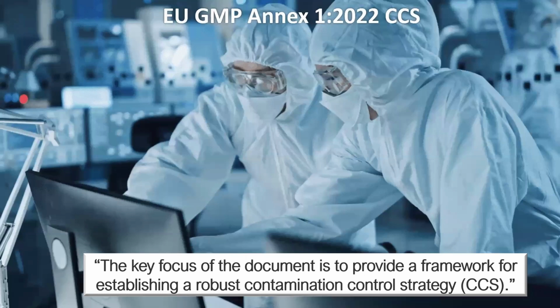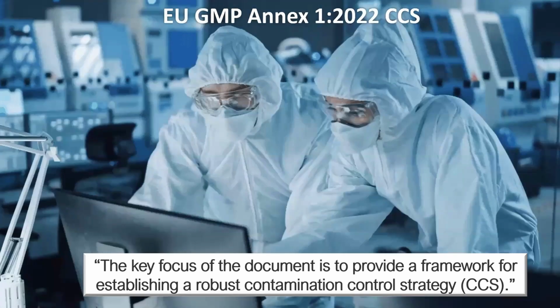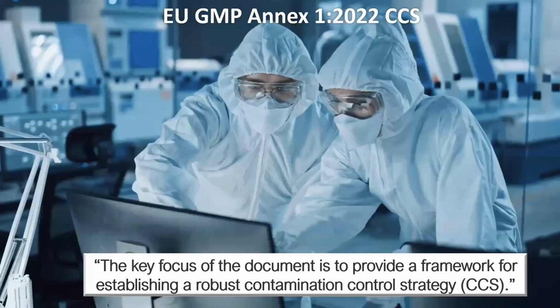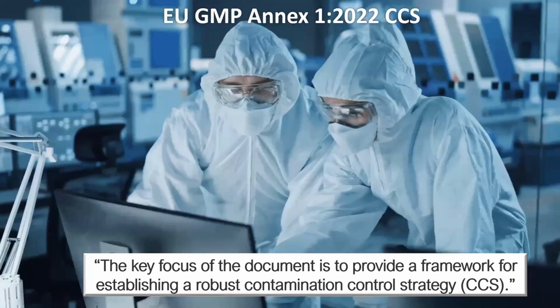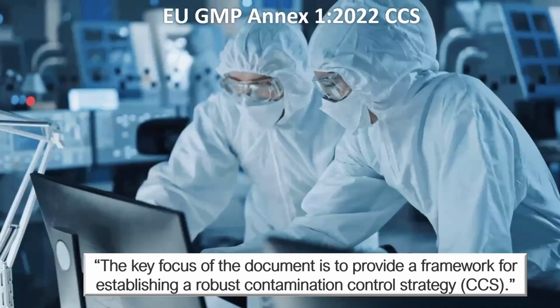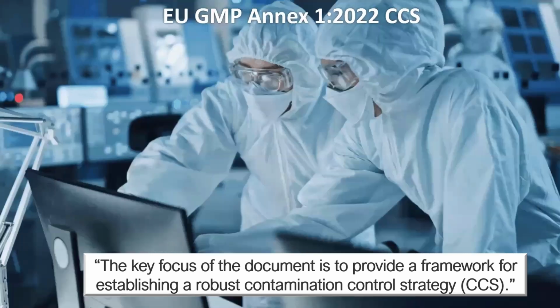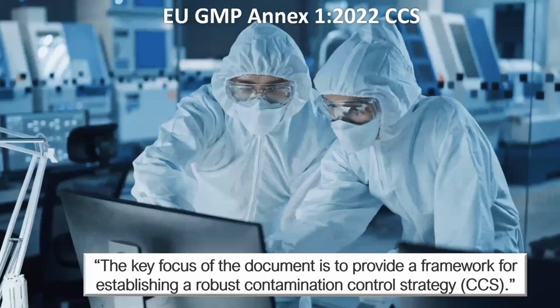And the use of digital technologies such as real-time environmental monitoring with particle counters, air samplers, and advanced data analytical tools allows for the collection and analysis of vast amounts of data. And the data can be used to make informed decisions quickly, improve the quality of the products, and ensure compliance with regulatory standards. And digital data also supports data integrity and governance within the contamination control strategy. It ensures that all data related to the contamination control is accurate, complete, and reliable throughout its life cycle. And this is essential for both regulatory compliance and ensuring the effectiveness of the contamination control strategy.